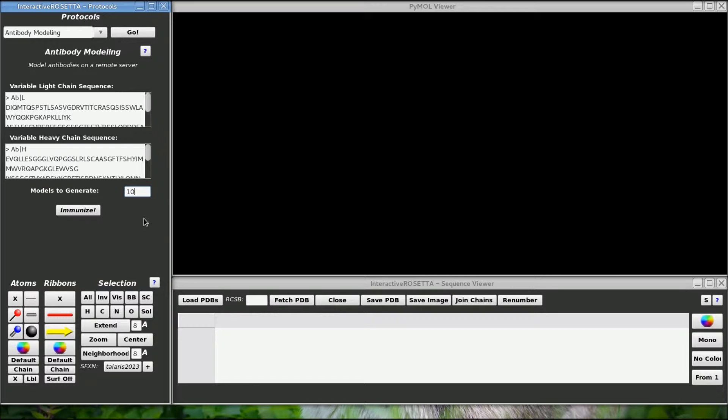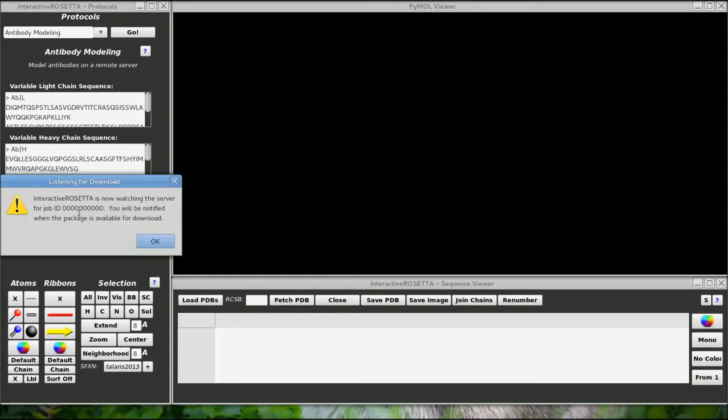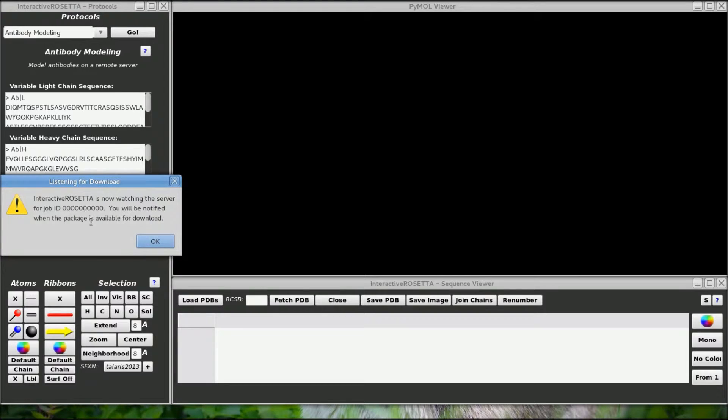When I am ready, I will click this immunize button. Yes, I do like being cute with button names every once in a while.